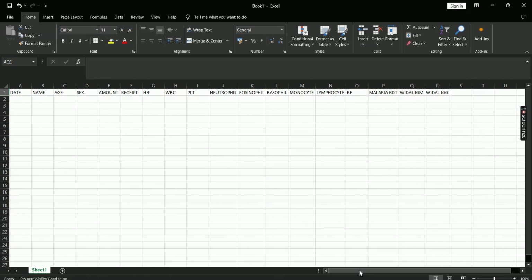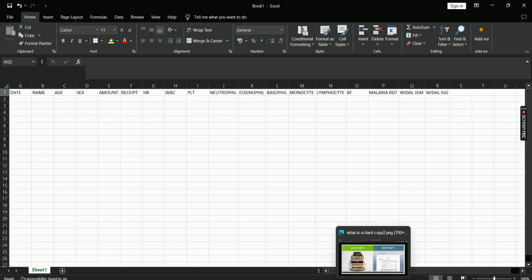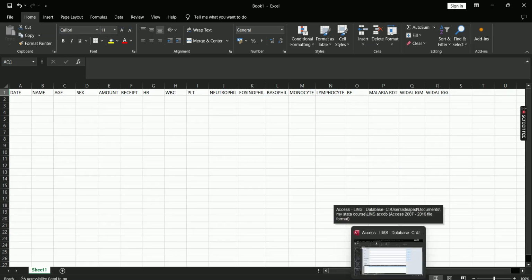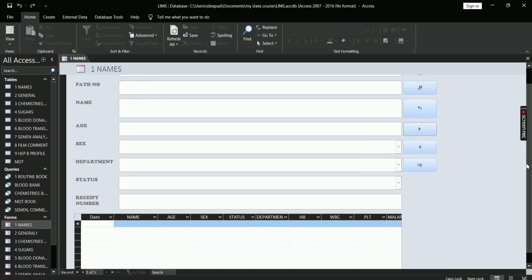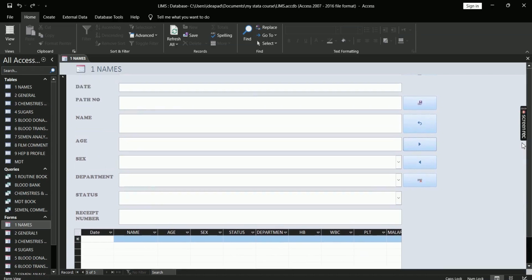So today I just came to propose using Access to capture data. Of course, I could render training on how to design something like this for your lab, but today I just came to demonstrate one of the Access products I designed for a facility.